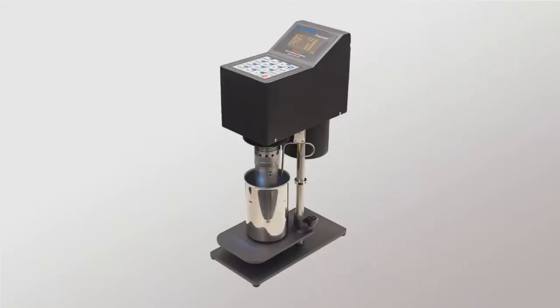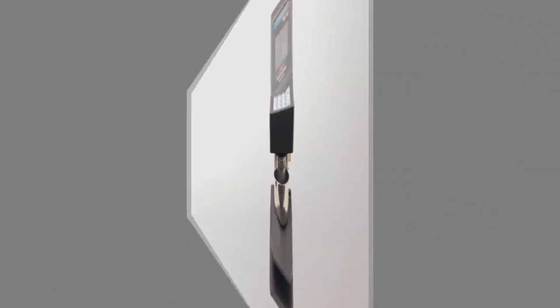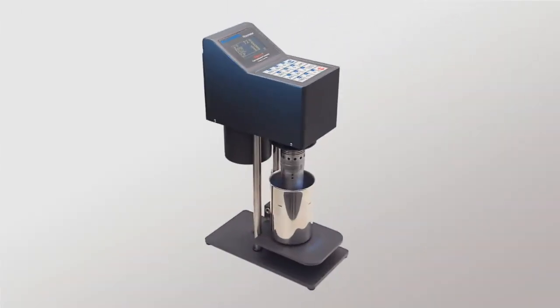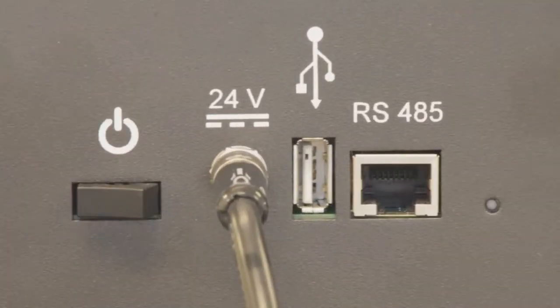Rheovator has a small footprint and weighs about 15 pounds. It's the right size to use in the lab or in the field. And because you don't need a network connection or a computer to capture data from your tests, you can use it anywhere. With a universal power adapter, anywhere really means anywhere in the world.